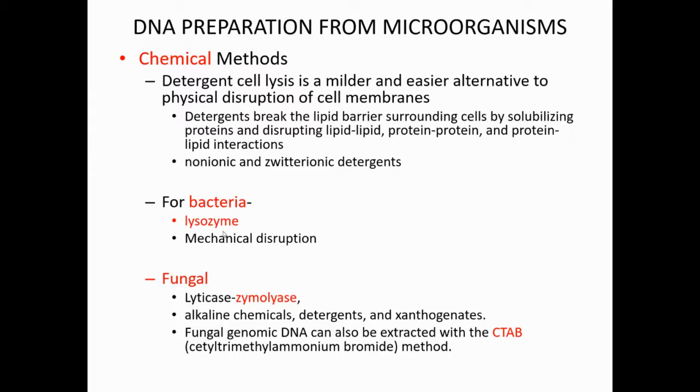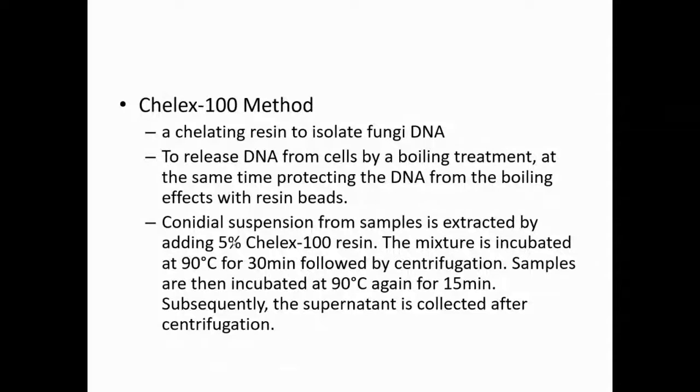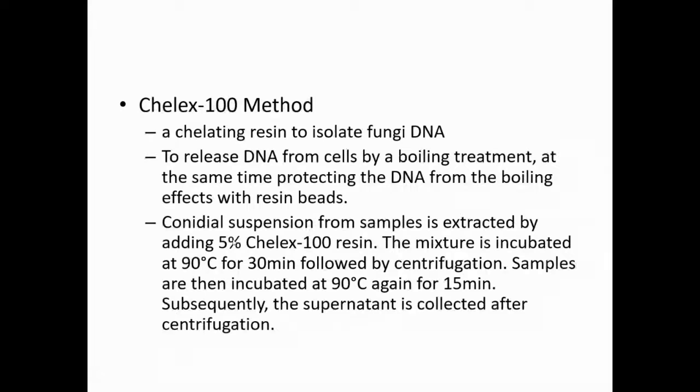So we have lysozyme for bacteria and lyticase, zymolase for the fungi. That's DNA preparation from microorganisms. And Chelex 100 is a chelating resin. It has a high affinity for polyvalent metal ions, and can also be used to isolate fungal DNA quickly and efficiently.